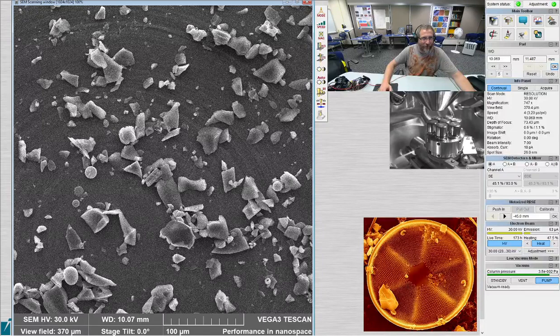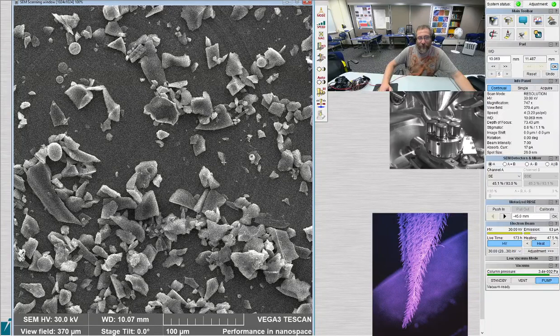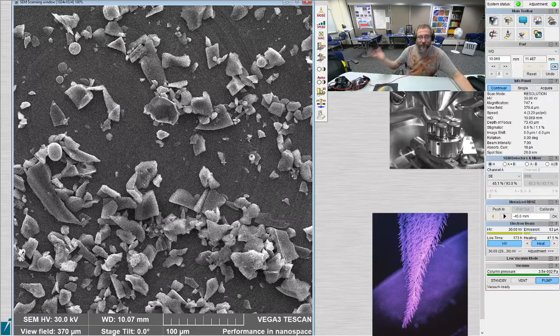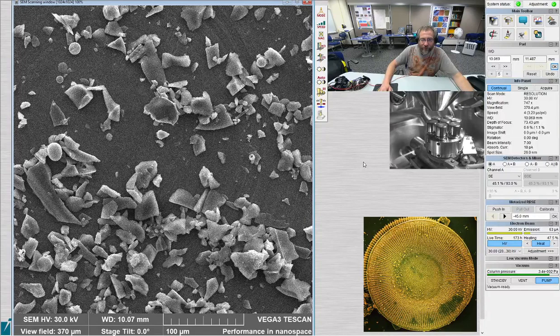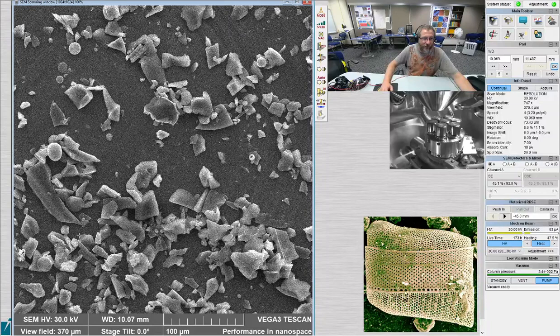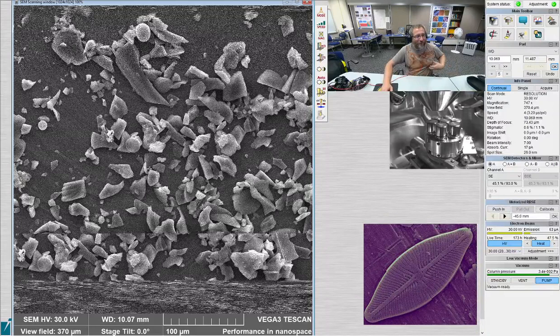So what I did for this, I only prepped samples from Grove. I have a whole other set of just samples from Ashfall 17, or whichever one it was we were looking at. For the carousel that we're looking at here, every one of these is Grove. I basically used almost every bit of our material. There's a little bit left, but I was like, what are we saving it for? You have some still, and Mark has some still. So I figured this would be the best chance for us to capture everything that we needed.